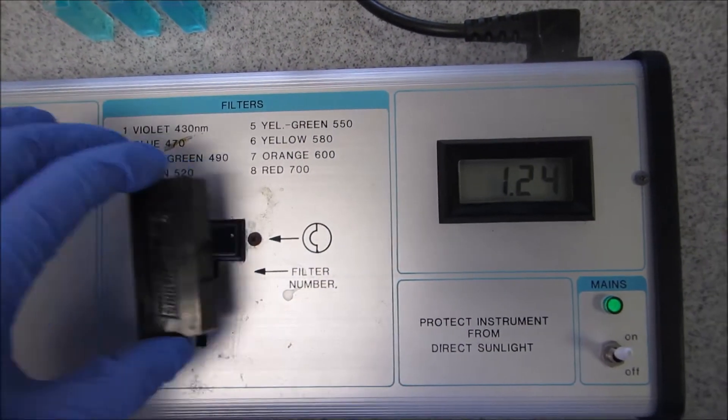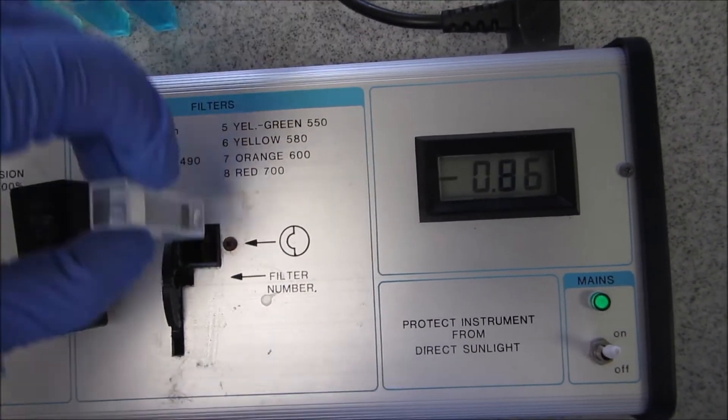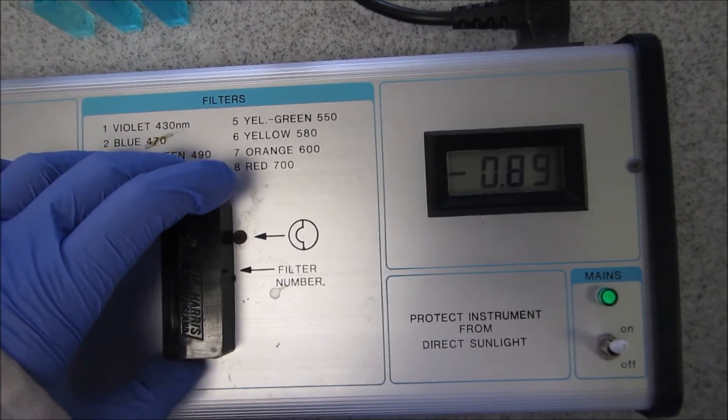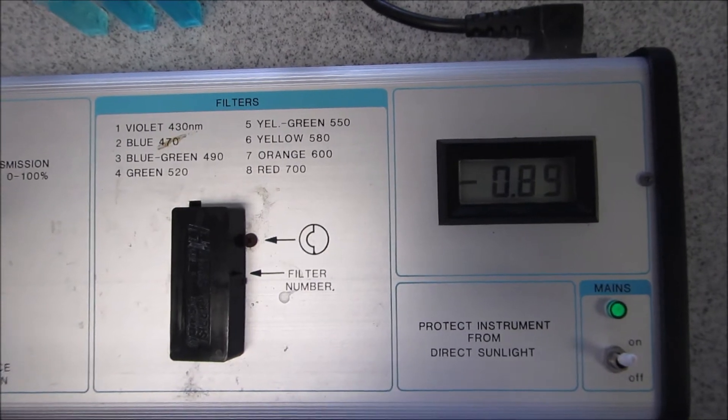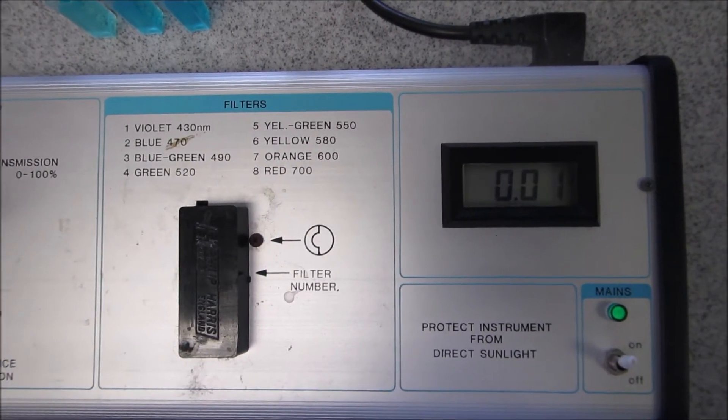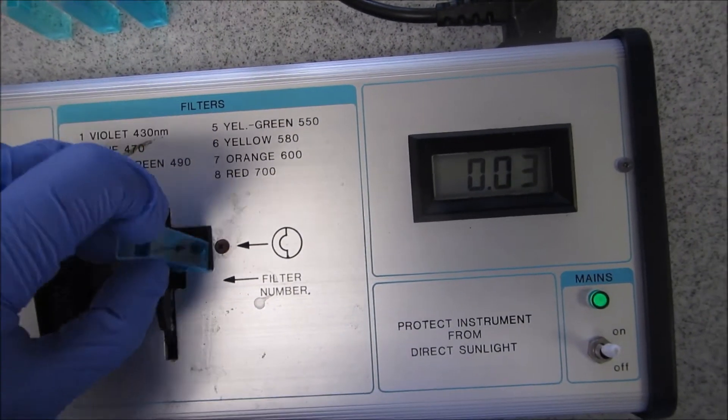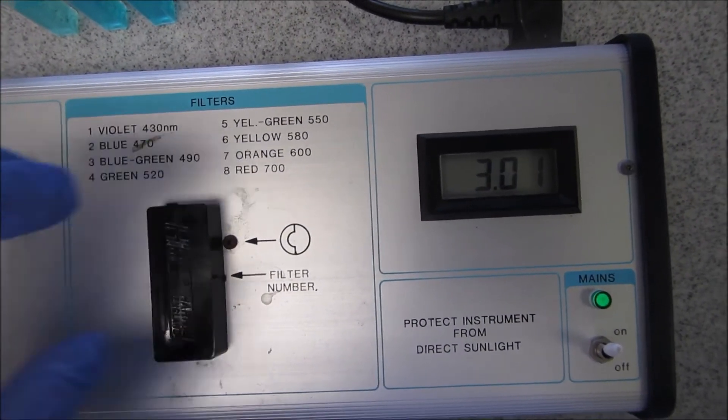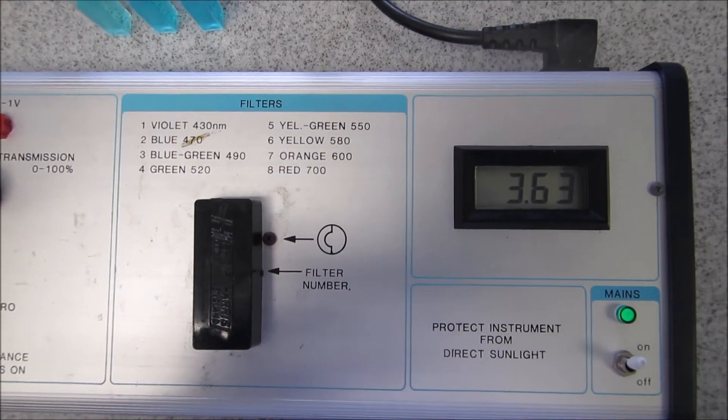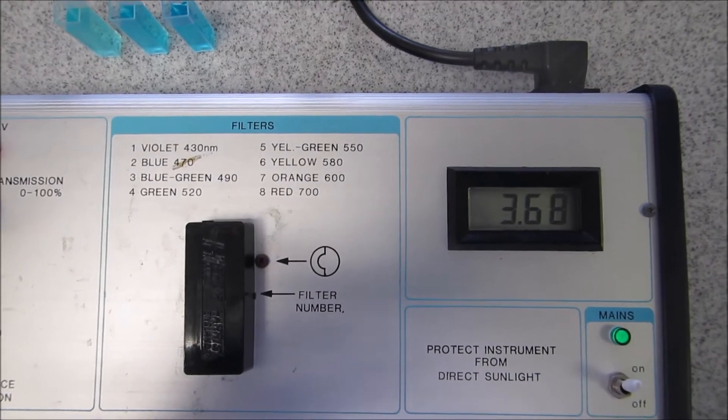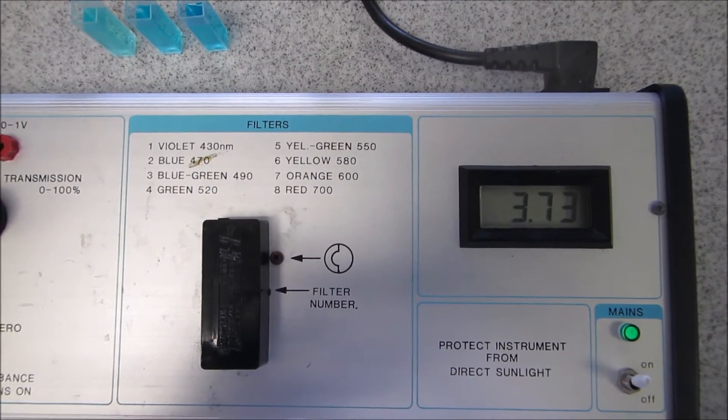I'll try the final one which is 700 nanometers. I'll put in my blank and zero it. So if this is less than 1.26 we're going to go back down to the orange. It's higher, so this is the maximum absorbance that we've got on the 1 molar. This is the wavelength that we're going to use for all further readings.